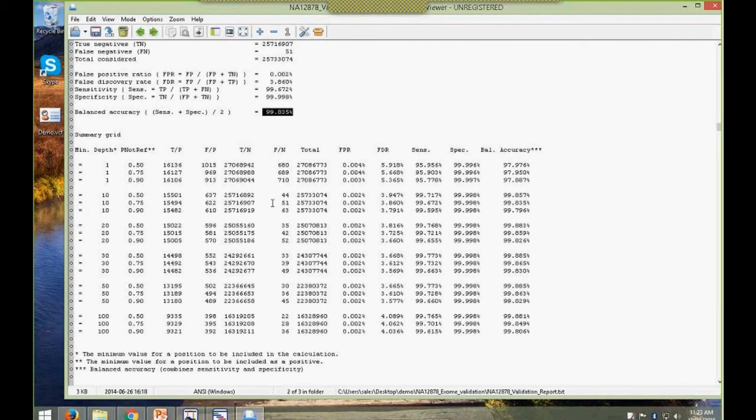And then I get a little bit more detail to see what my accuracy is. A real common question we'll get is how deep do I have to sequence my samples to get the best accuracy? Do I need it to be 1000x, 100x? Is 10x enough? And so we actually calculate the accuracies at different depths. And we can see, usually at about 20x coverage our sensitivity is optimal. You can see even at 10x we can be pretty close though. So FDR goes higher as you get thinner coverage, and it seems to be optimal right around 20x. We get really nice results.